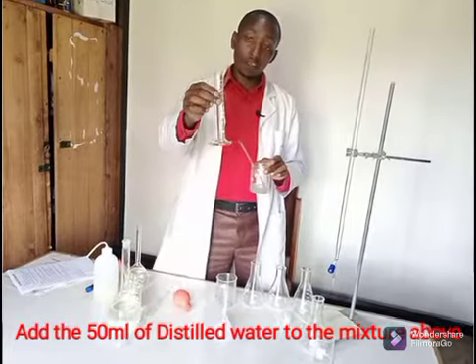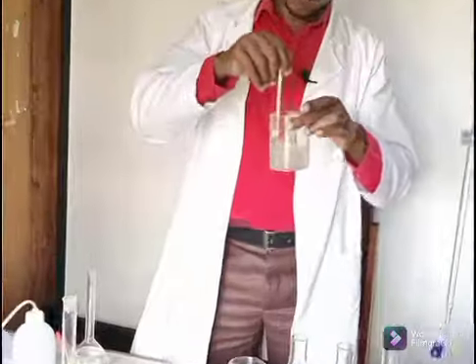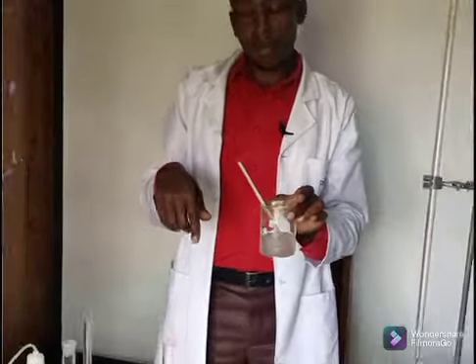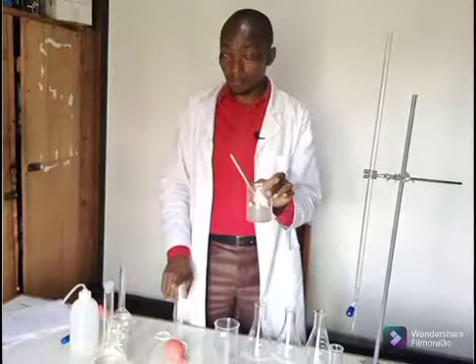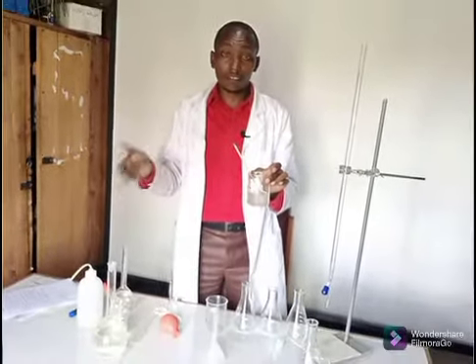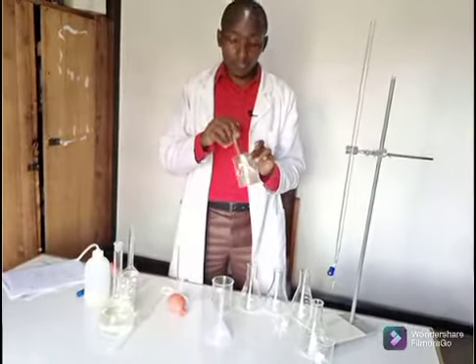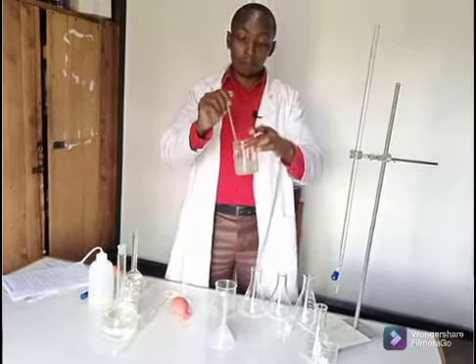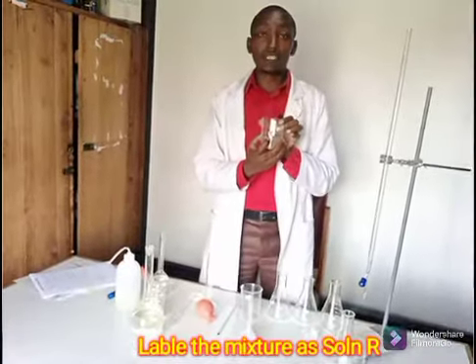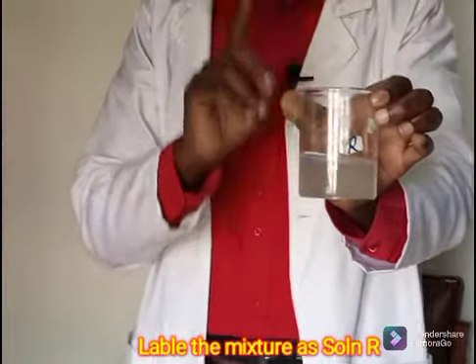So I have 50 of distilled water that I add. Remember, for this procedure, I'm adding just 50. In other cases, you'll be told to take maybe a 250 ml volumetric flask, then you add water to the mark. So mind the procedure. I have the solution, and I'm instructed to label it solution R.